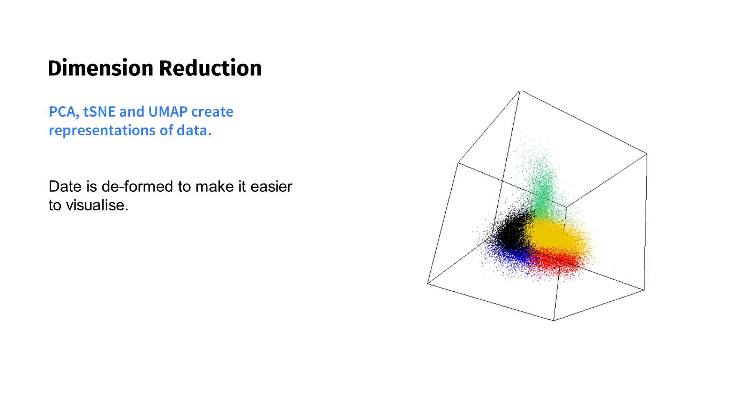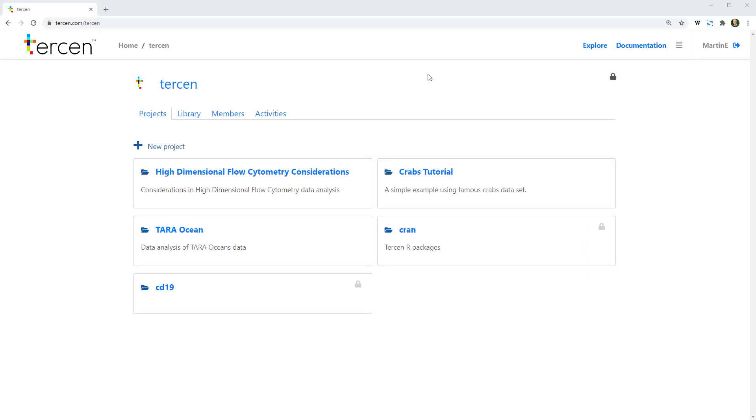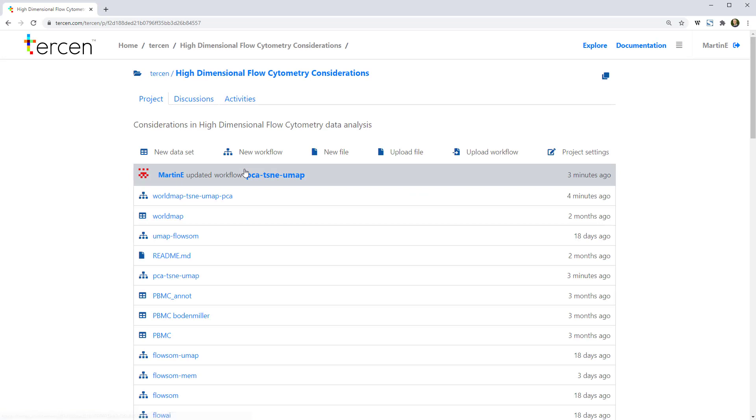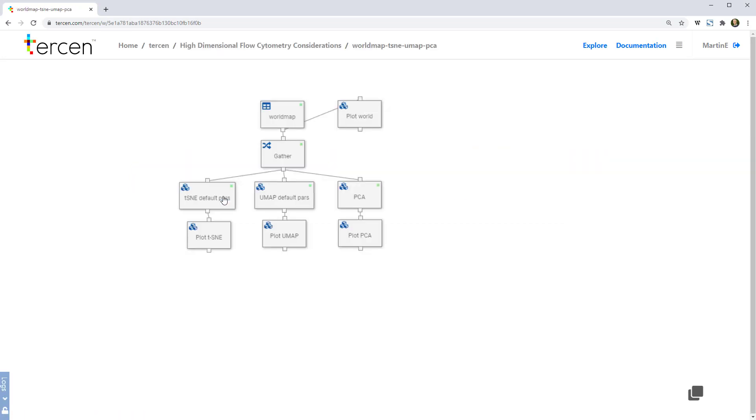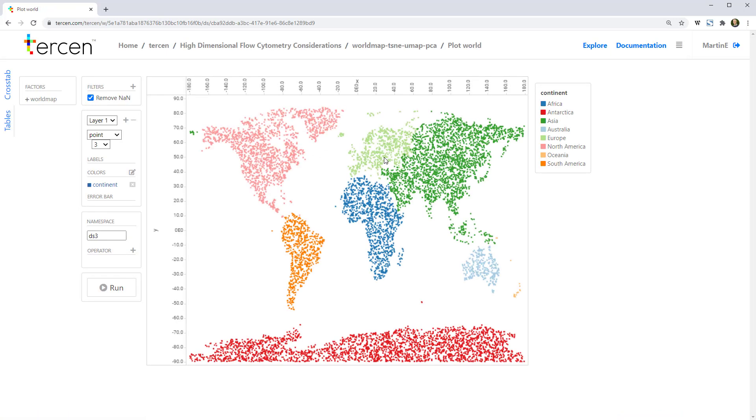Let's go to the Tersen system, where we can look at this in more detail. Nikolai Oskolkov, a bioinformatician at the SciLife lab in Sweden, created an experiment that demonstrates this wonderfully. We have recreated a version of his experiment in Tersen to illustrate this data deformation, and show why UMAP is the preferred non-linear way to perform dimension reduction.